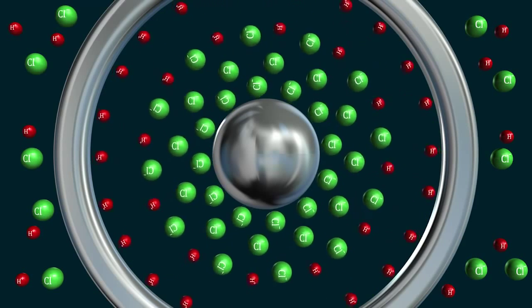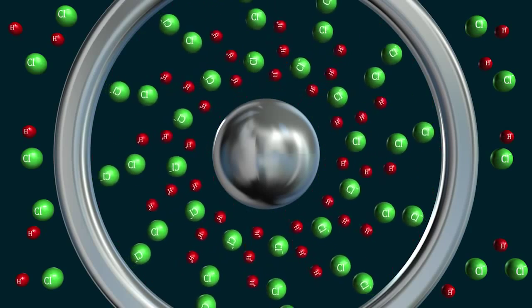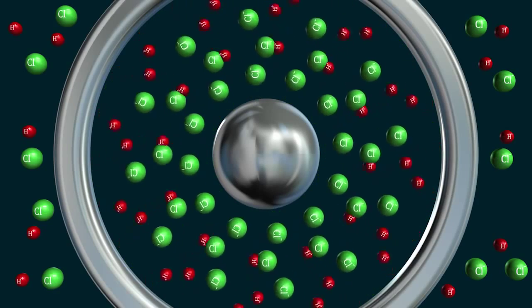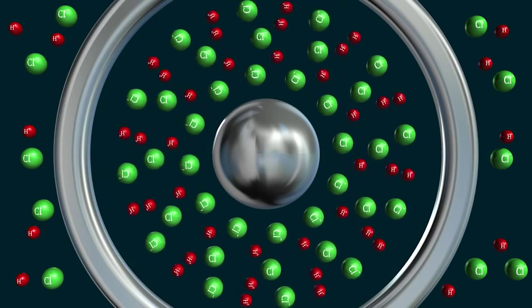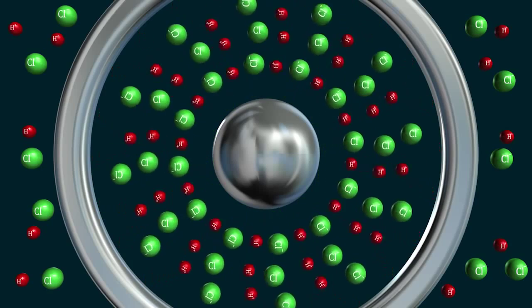If, however, the ion concentration becomes too high, the Coulomb force increases. This electrostatic force leads to a mutual repulsion of the ions and thus a reduction of the current. The effect is called polarization and occurs with highly concentrated media.